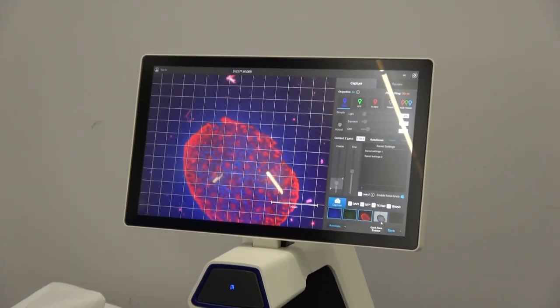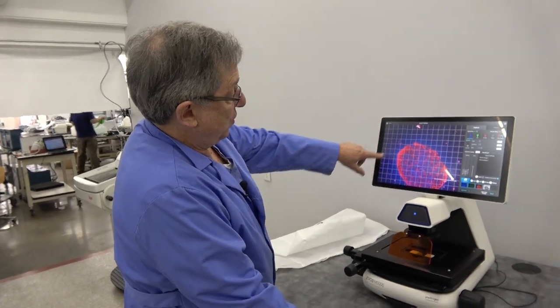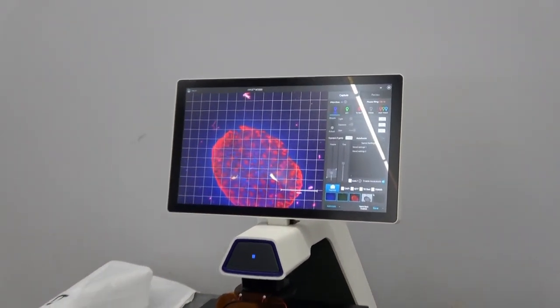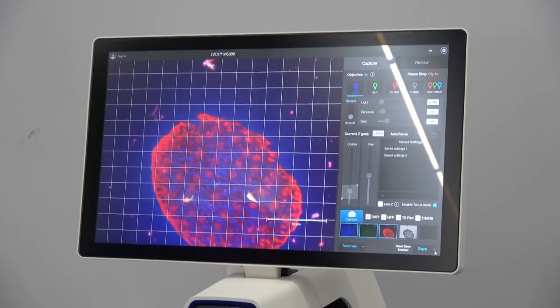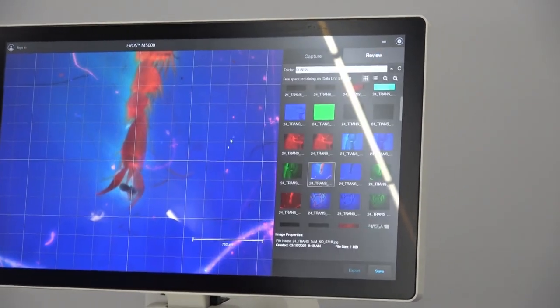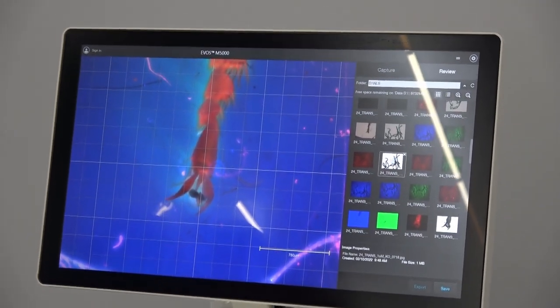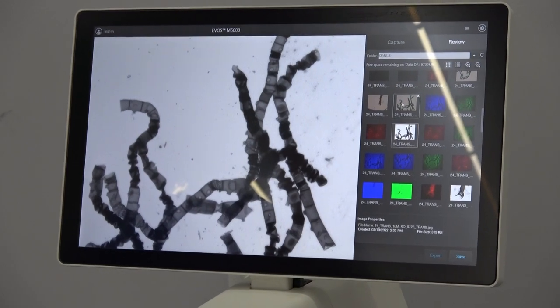And it captures using those new settings. Since we have a filter in there, we just turn that background, that color off. And then we can save these out. We can review what we've saved, what we've captured, and a very easy to use menuing system.